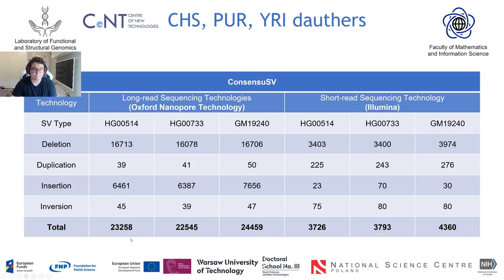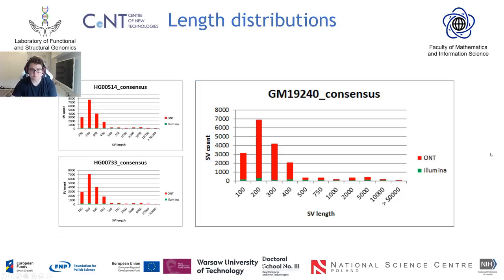So it's a great increase in numbers, which supports the fact that Oxford Nanopore detects many more structural variants than short read technologies.